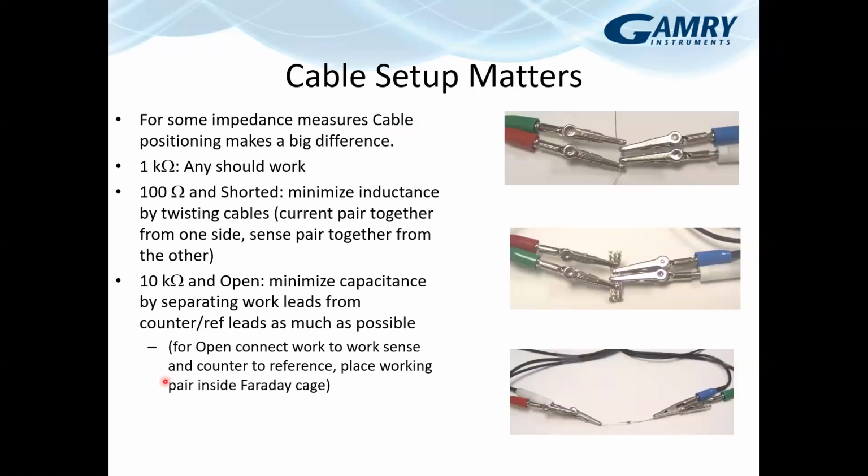One other side note. For the open lead, you actually don't have anything here, but you still short these together, the current and sense on each side. The work and work sense, blue and green, would go inside of a Faraday cage. Counter and reference would stay outside the Faraday cage, actually.